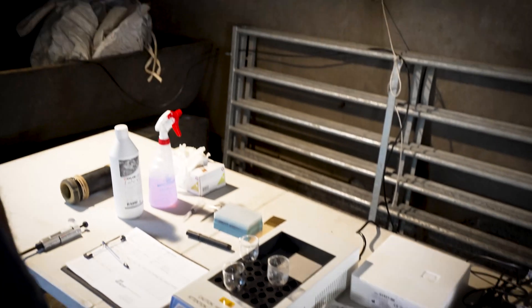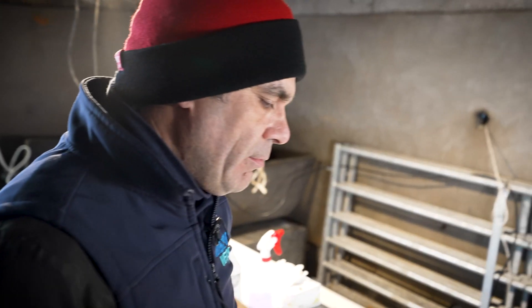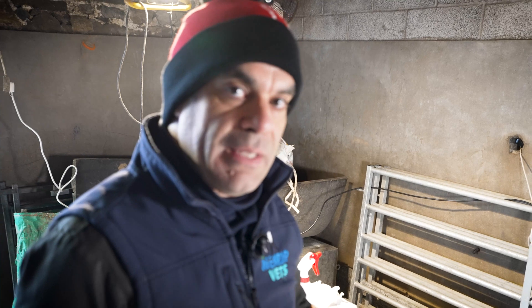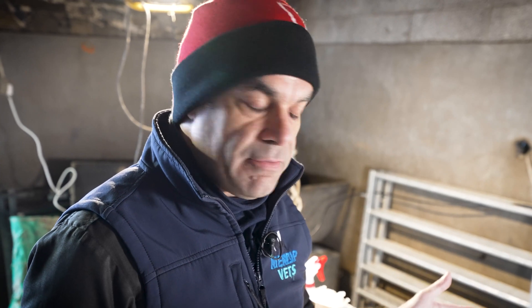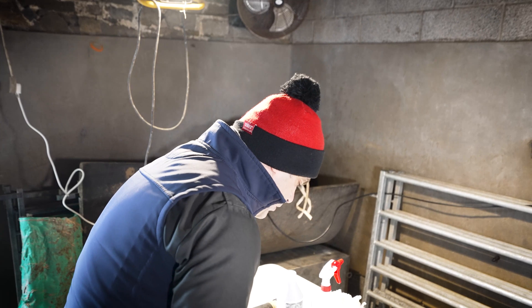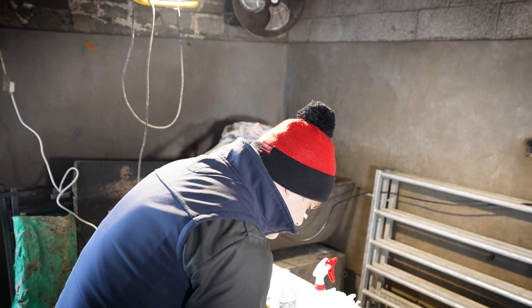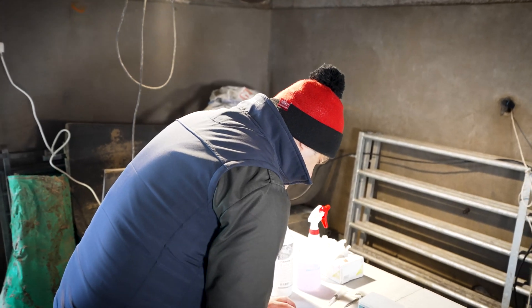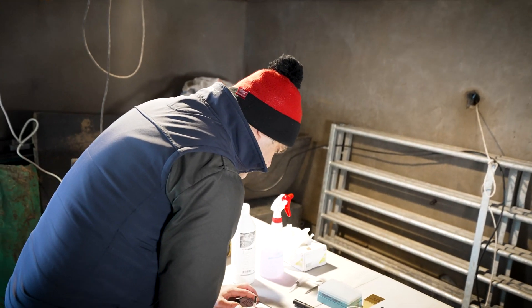For older animals, and especially when we do AI, we prefer that concentration to be in the billions. But that's a very good start for a ram that is going to be used for natural service in a flock. We make a note of all that — 80.9 times ten to the sixth.